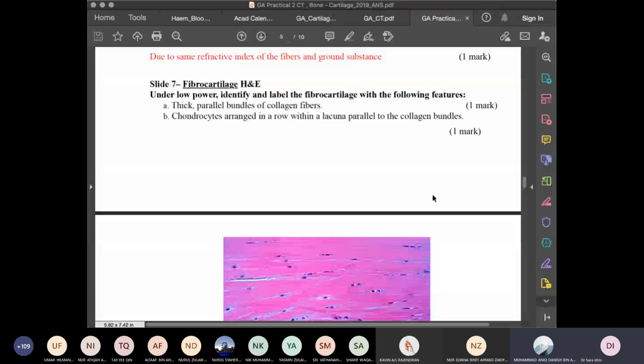All right, thank you, doctor. So the reason why you always have this chondroblast is to help, because these are all mature cartilages. These are cartilages that are already formed. So in that sense is the importance of having the perichondrium. But when you're building something, obviously you will have the chondroblast there, in embryos or in children. Okay, understood. All right.